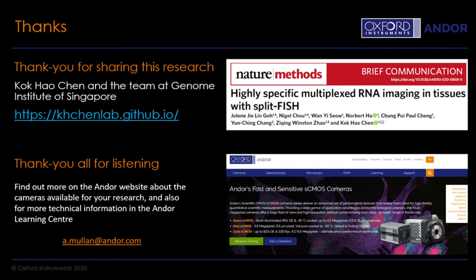I think this is certainly a goal. For now, we are using the standard wide field microscope to do this imaging, so very thick sections will be challenging to focus deeper.